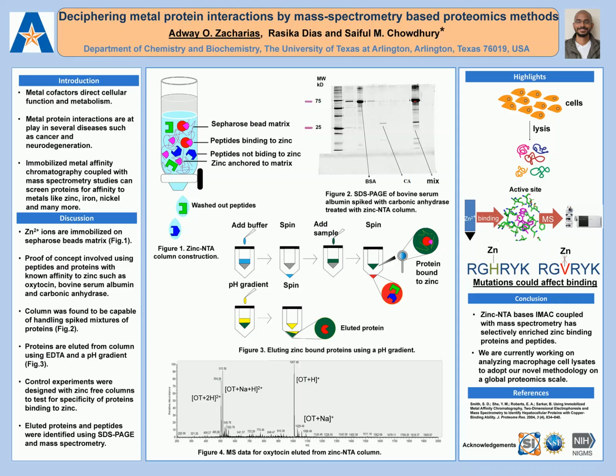I'm going to be presenting my work, which is deciphering metal-protein interactions by mass spectrometry-based proteomics methods. The reason we're interested in doing this project is because metal cofactors have been involved with directing cellular function and metabolism, and the interaction between metals and proteins has been implicated in a variety of diseases such as cancer and neurodegeneration.